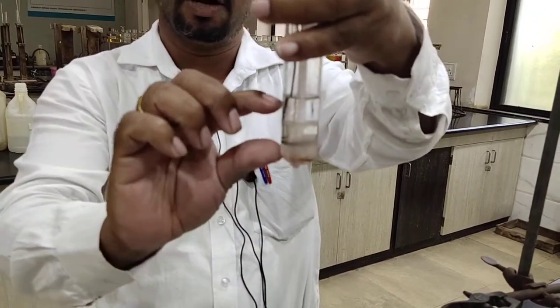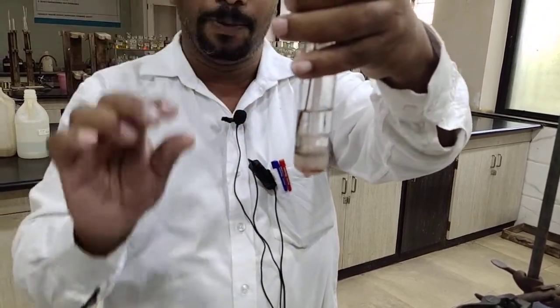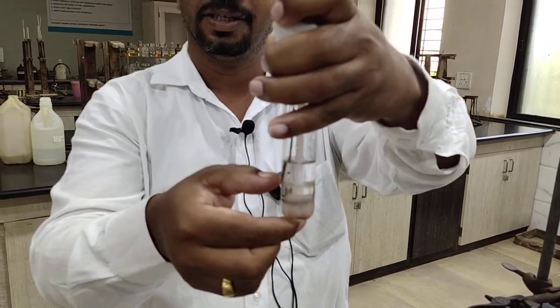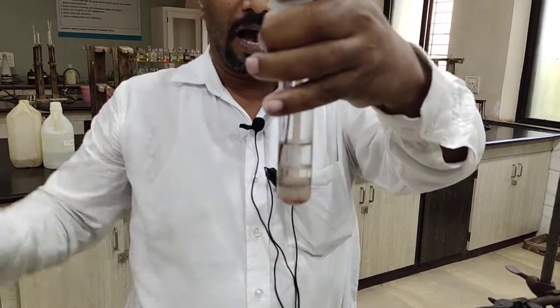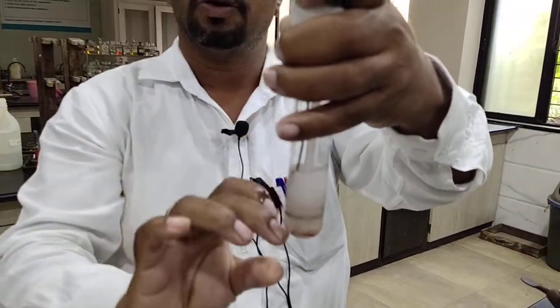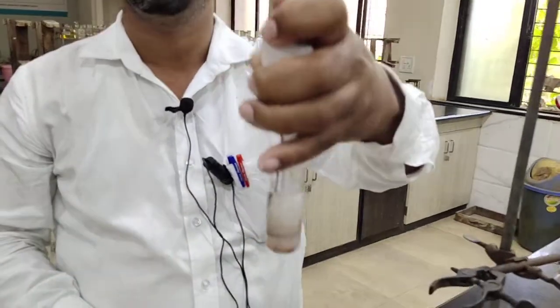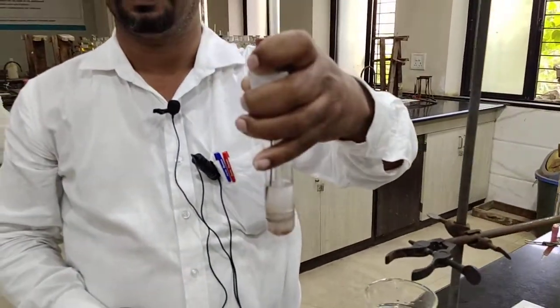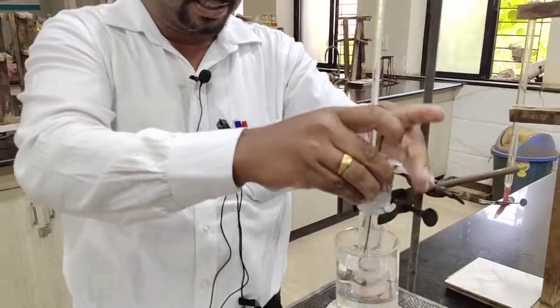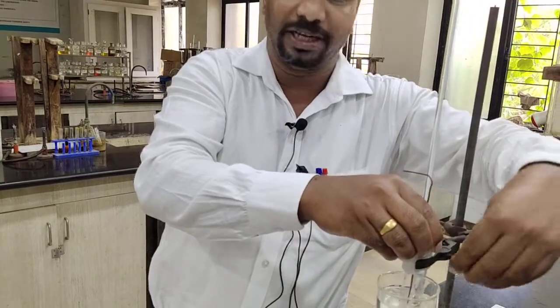When we take the two layers, that means two different compositions of the system are there. After increasing the temperature, the two layers are going to completely mix in each other. So we have to find out this miscible temperature, and note down the temperature when the mixing occurs.